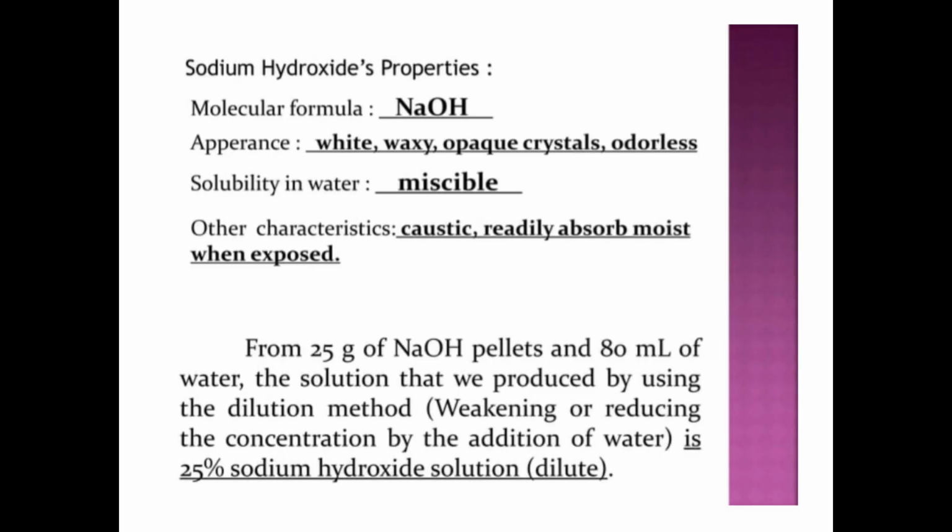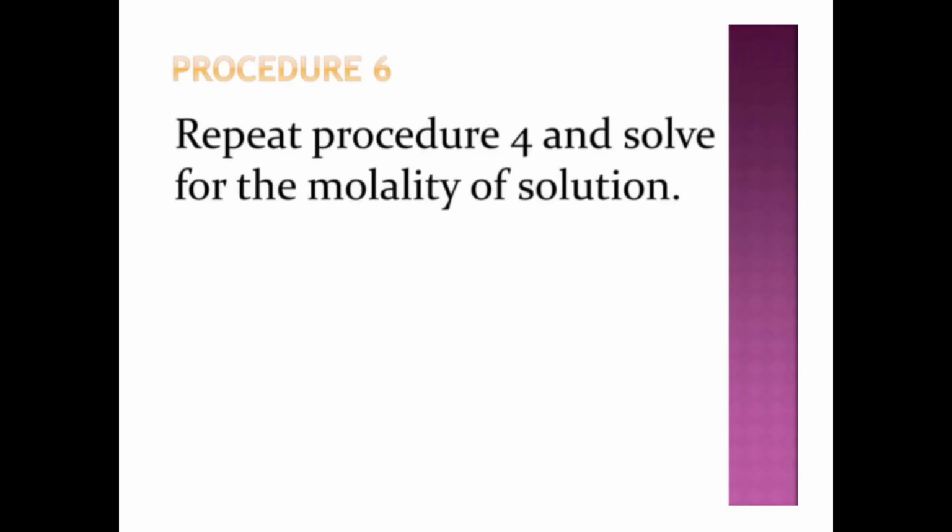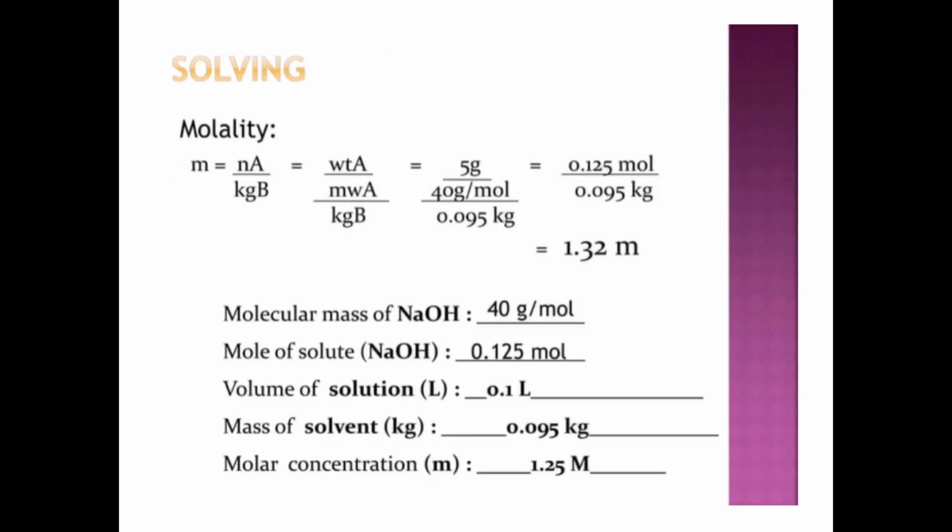So that's how to prepare a base. Any other base like sodium hydroxide, calcium hydroxide, etc. can be prepared using this information. Now, you can repeat procedure 4 that we did for the molality of the solution. This is how you do it if you are looking for the molality of that solution.